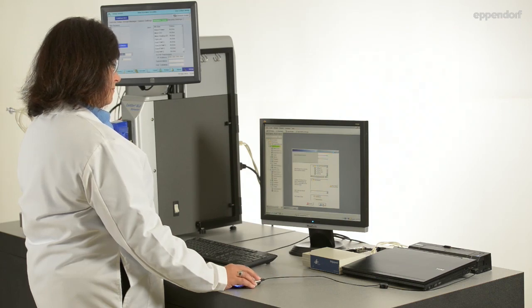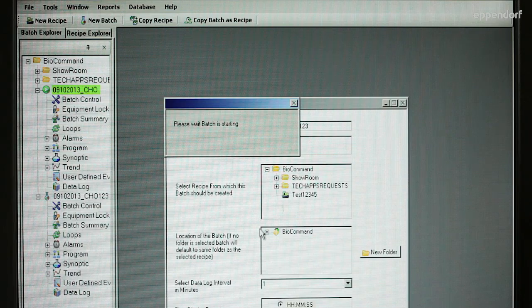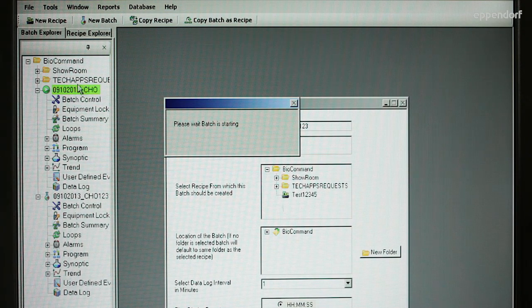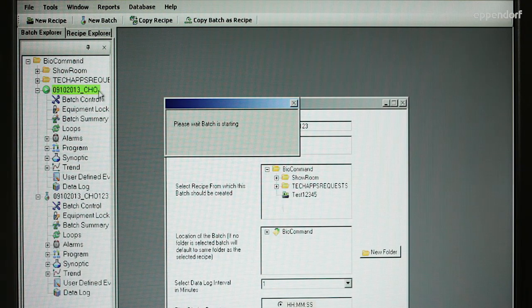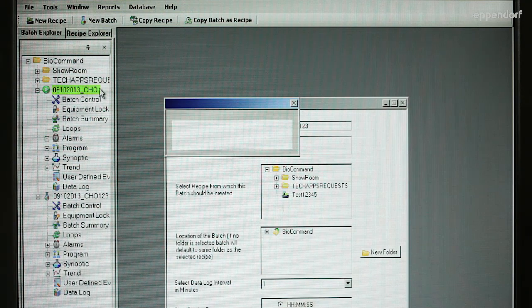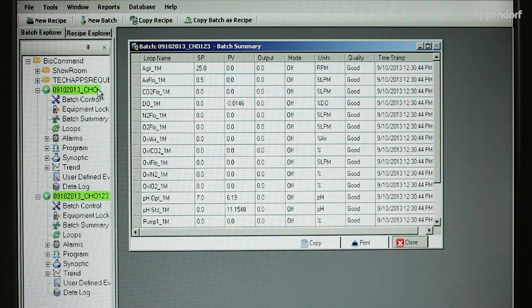The batch is now running, which is confirmed by the green highlight on the batch name in the Batch Explorer panel. Multiple batches can be run at the same time.